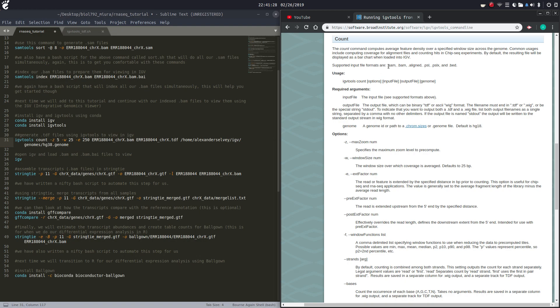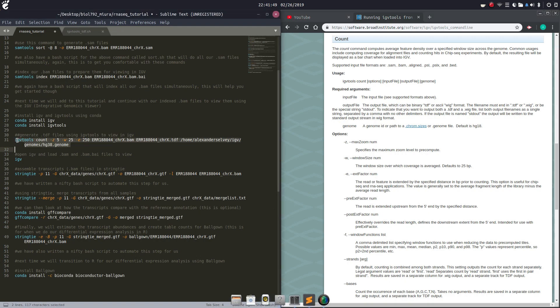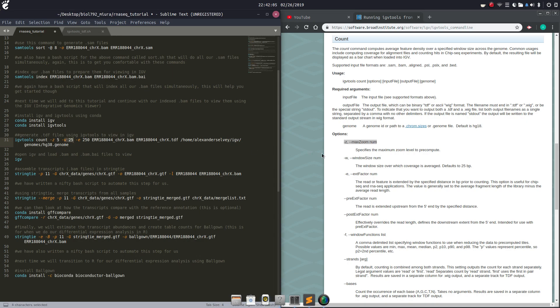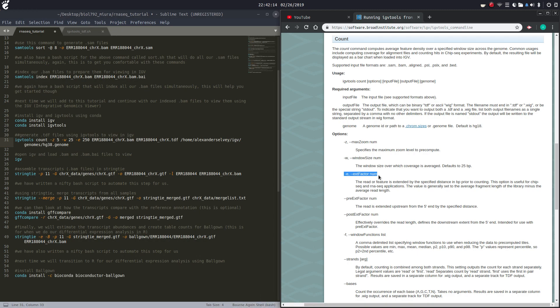Today we're going to be using the count function. Count can be used to create different files — today we're going to be creating TDF files, using the .tdf format. Our IGV tools command uses: count, then dash-z for max zoom set to five, dash-w for window size set to 25, and dash-e for the extended factor — so the read or feature is extended by the specified distance in base pairs prior to counting. This option is useful for ChIP-seq and RNA-seq applications.